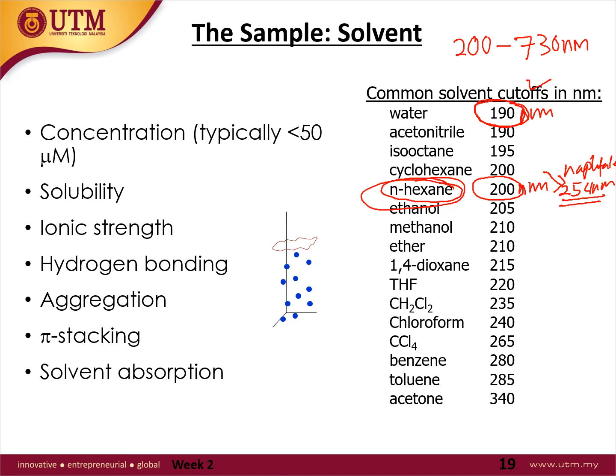If you are using, for example, apa benda? Chloroform, for example. Chloroform to analyze naphthalene, then you will have a slight problem, because the wavelength is now a small difference. Therefore, maybe chloroform will absorb a certain part of the radiation before it goes to naphthalene. Okay, that's why you have to select your solvent very carefully.